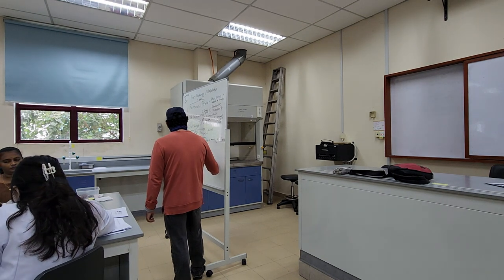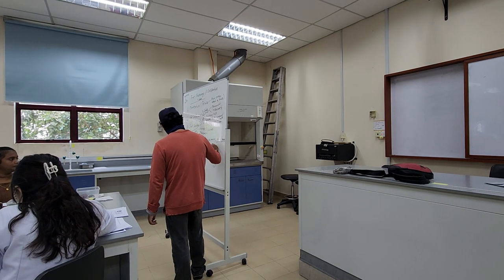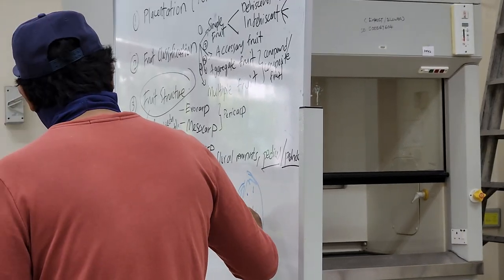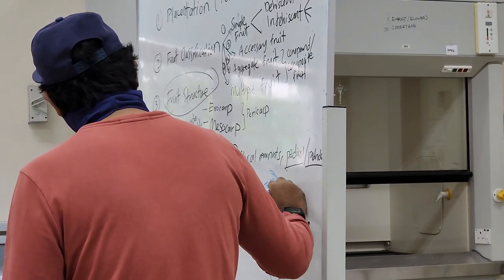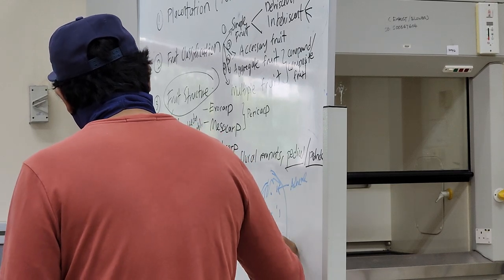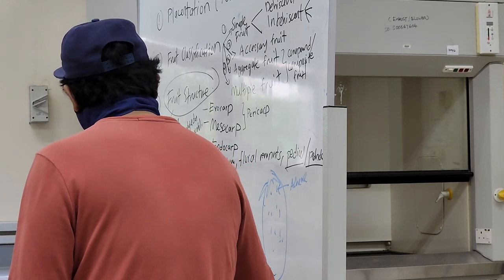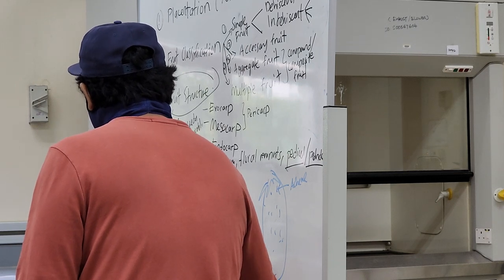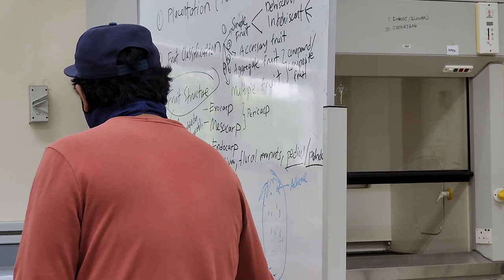Chinese strawberry. You got the little caps, that is the fruit, the achene. What about the red part? This red part is the receptacle. Receptacle swollen.